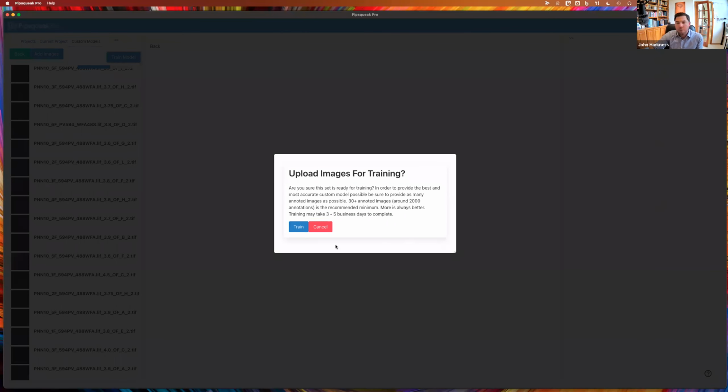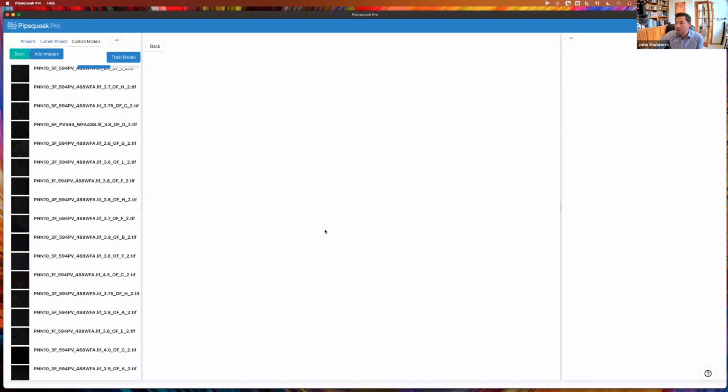And this is going to queue up a machine learning experiment on our servers that should return that result to you fairly quickly. This is a process that is becoming more and more automated all the time. And so our hope is that you can probably find a way to customize a model that's going to be very accurate for you using this really powerful machine learning technology.